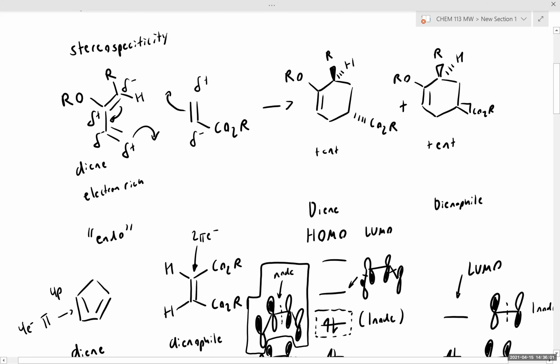So generally, when we look for these substrates, although you would expect that you can get either of the two regioisomers, the electronics of the diene and dienophile influence and determine your regio control. And that's another important aspect of the Diels Alder reaction.